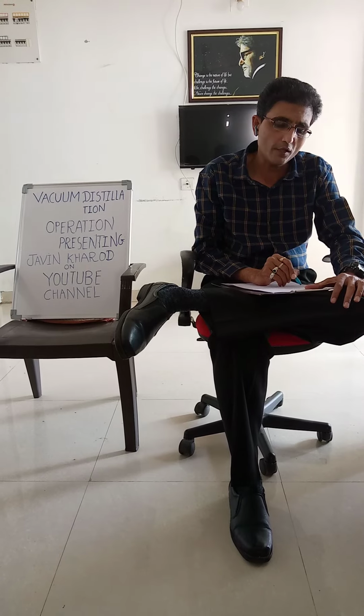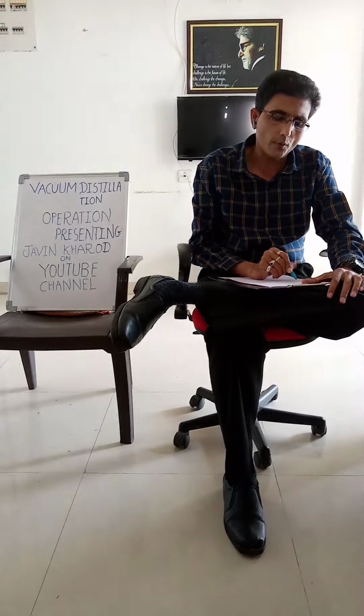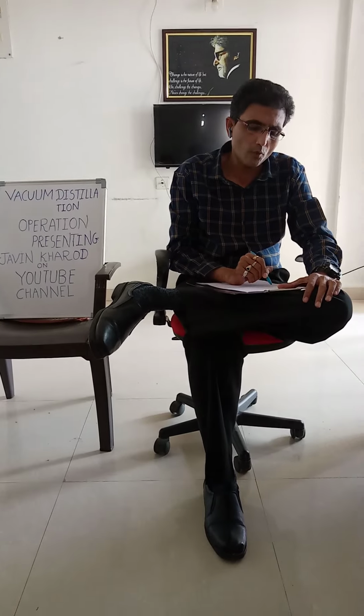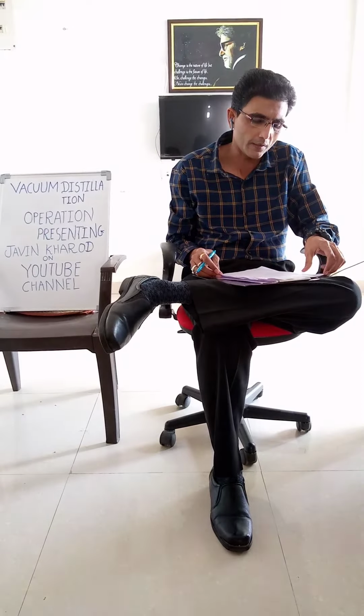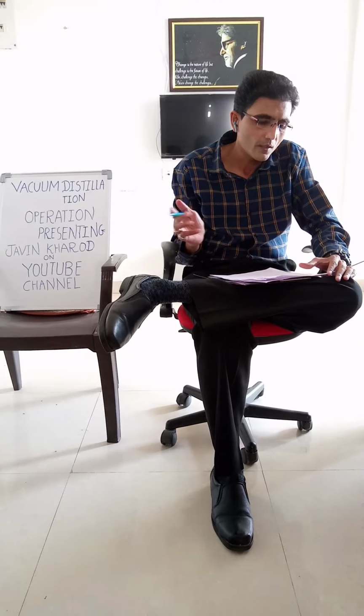Reduced pressure decreases the boiling point of a compound. The reduction in boiling point can be calculated using a temperature-pressure nomograph or the Clapeyron relation. Now some questions arise in our mind. What are atmospheric and vacuum distillations?